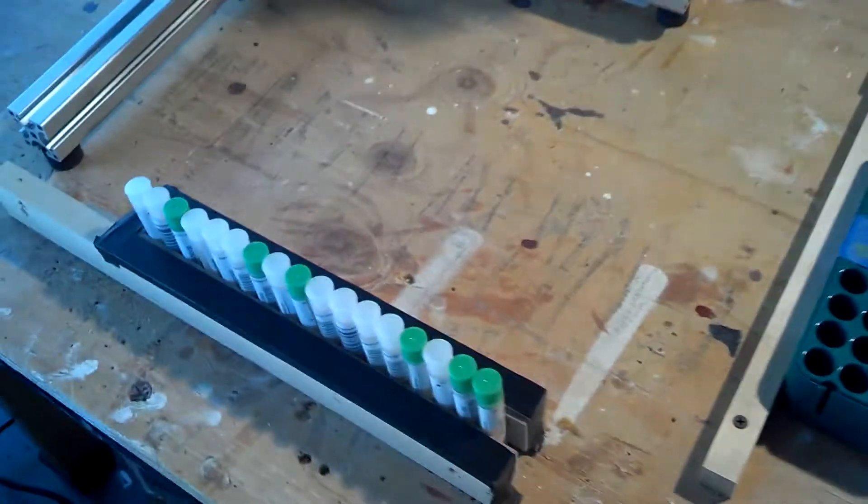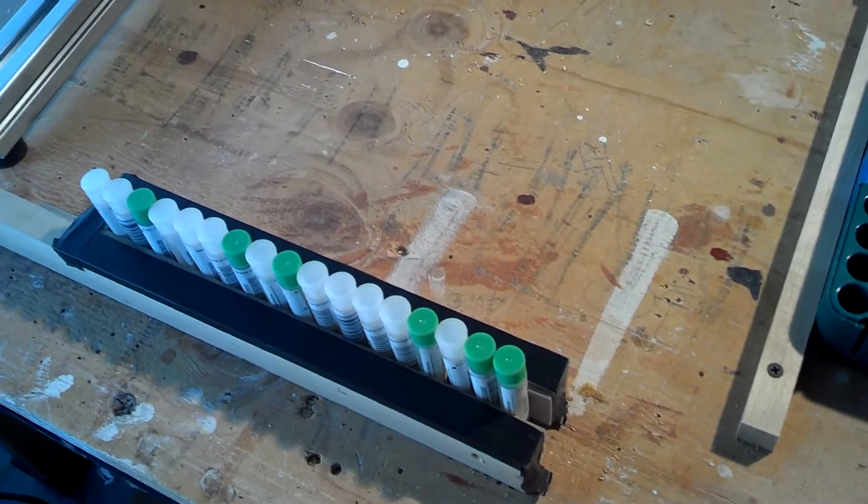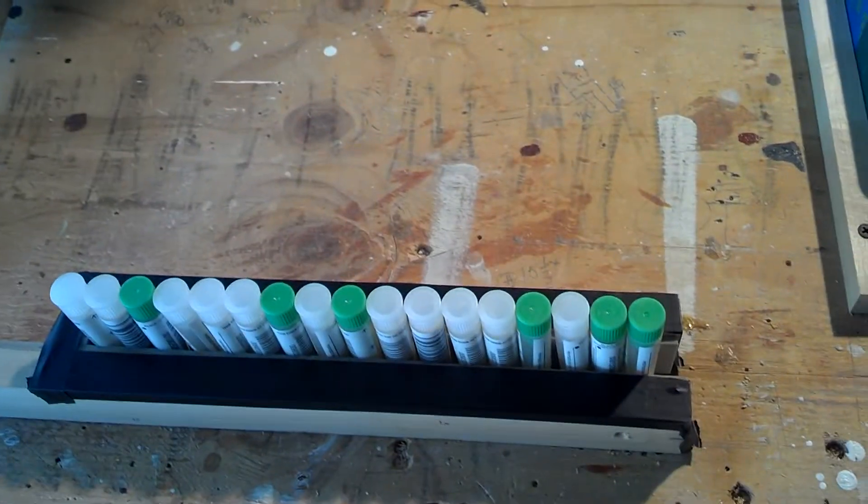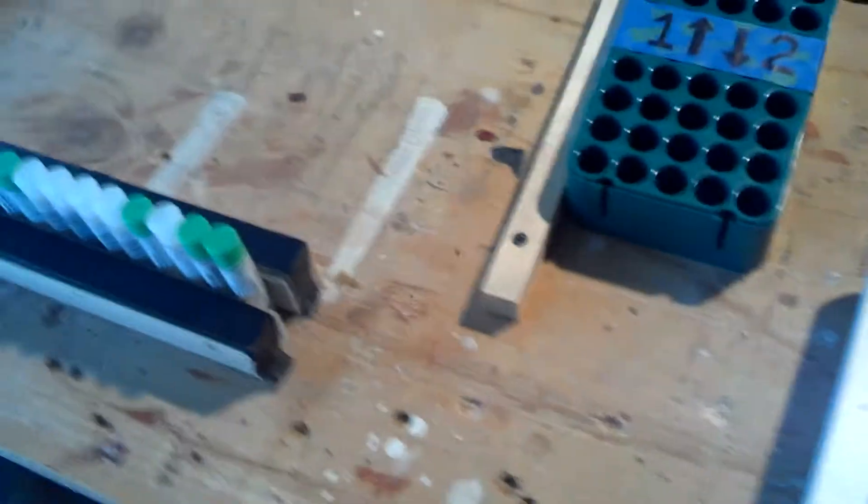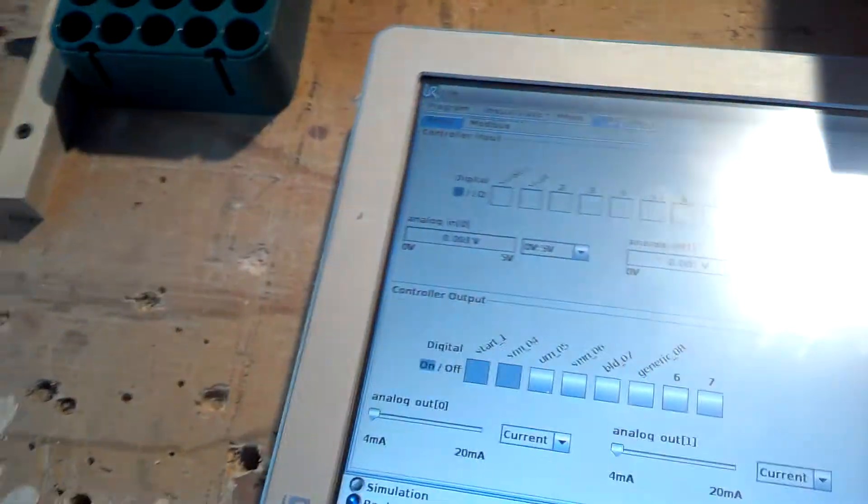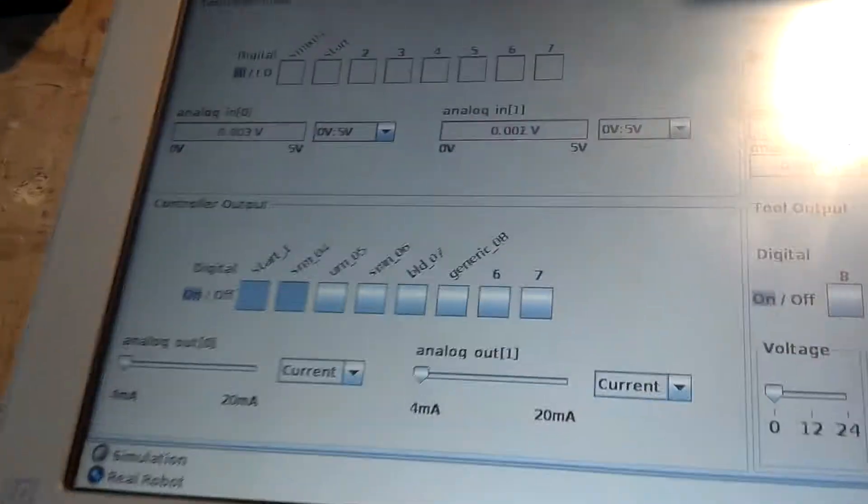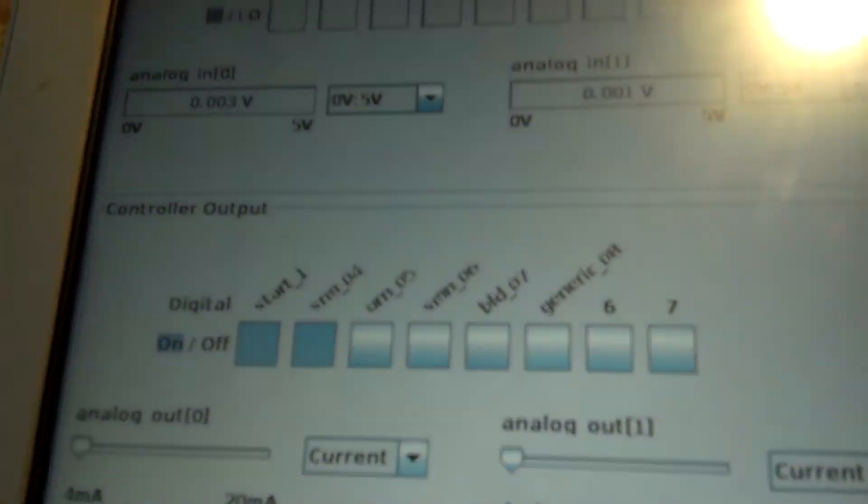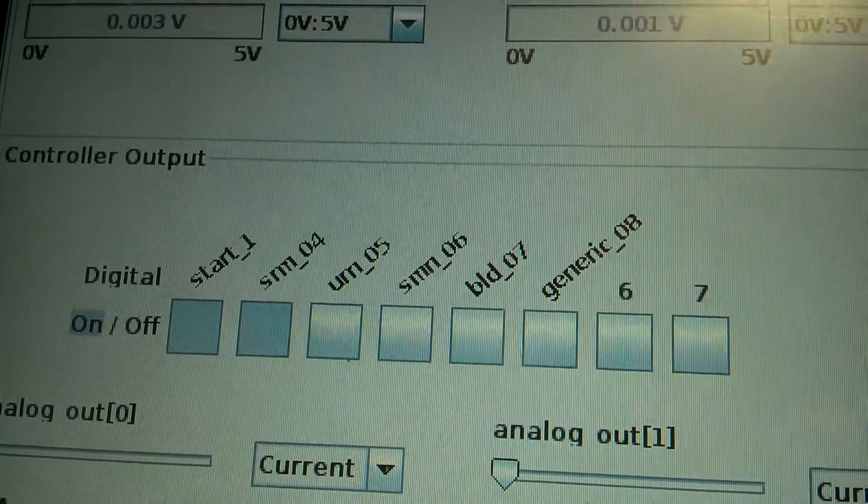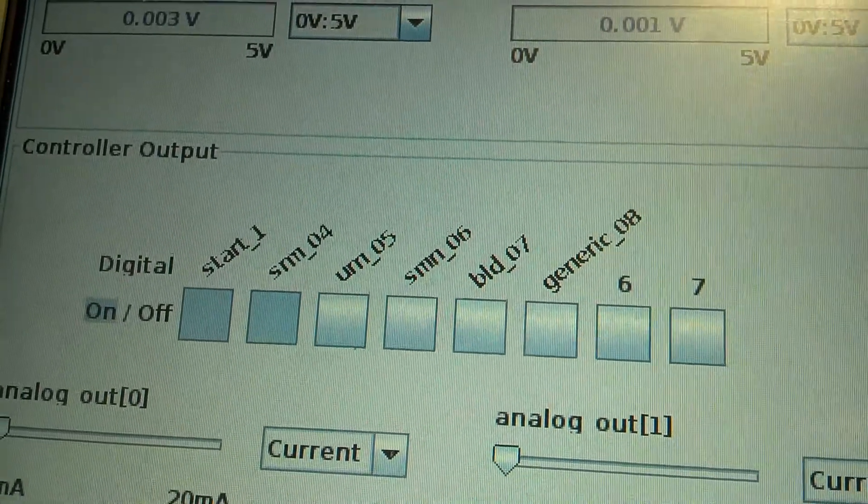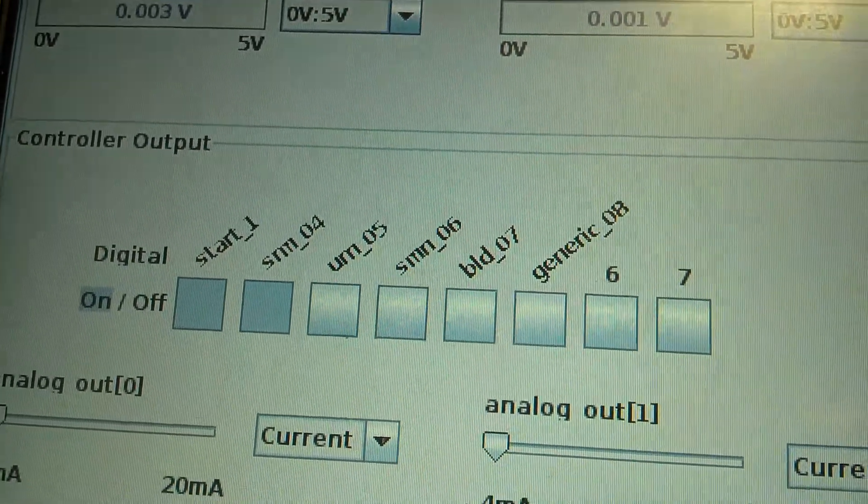So I'm just going to simulate. We're not actually sensing the barcodes of the test tubes or the colors or anything like that, so I'm just going to simulate doing that by forcing outputs on and off on the screen. I've got it set up for SRM04, UM05, and then I made up some other names.